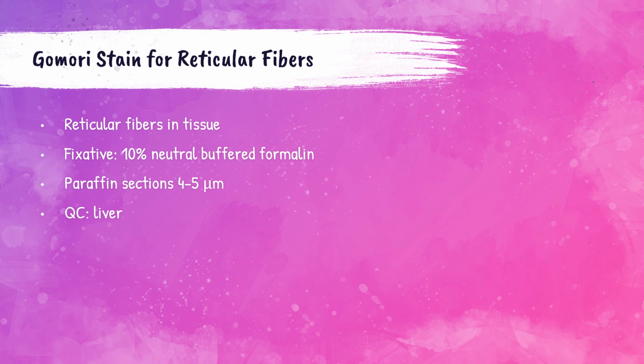For this stain, potassium permanganate oxidizes hexose sugars in reticulin fibers to aldehydes. The excess is removed by the potassium metabisulfite. Ferric ammonium is the sensitizer in this stain, and formalin is used to reduce silver to its metallic form. Toning occurs with gold chloride, and sodium thiosulfate is used to remove unreacted silver from the stain.